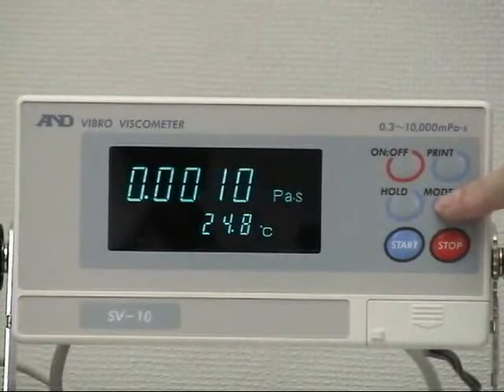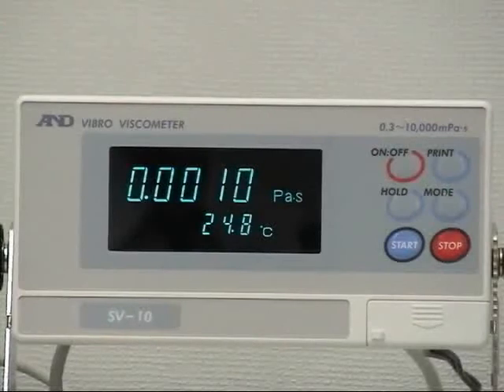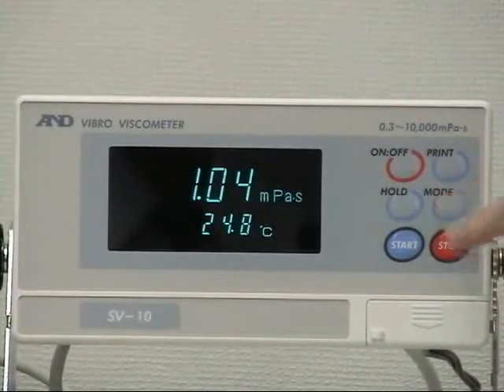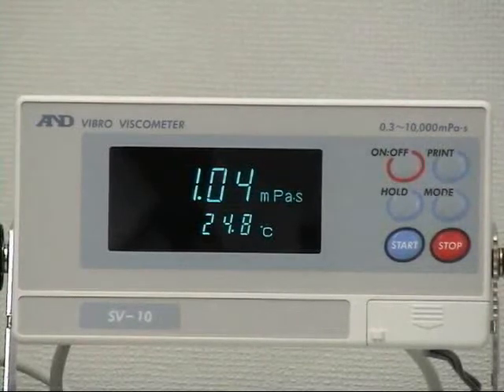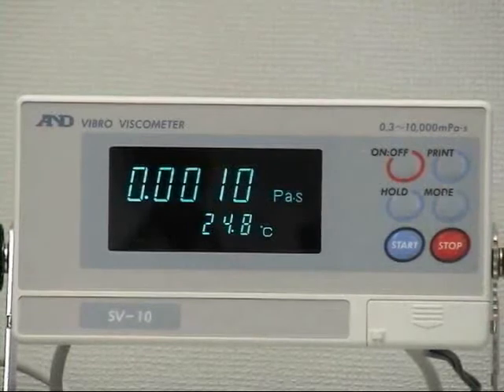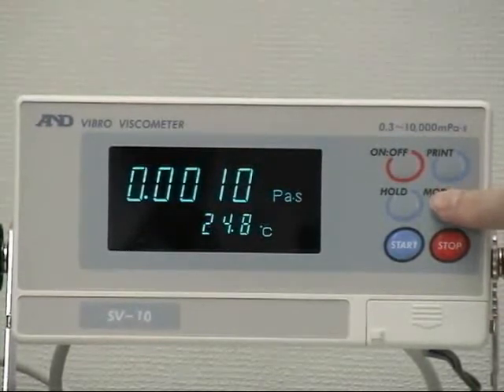Press the mode key to change the unit of viscosity between millipascal seconds and pascal seconds. Centipoise and poise can also be selected. Even in the hold function, the unit of viscosity displayed can be changed by pressing the mode key.